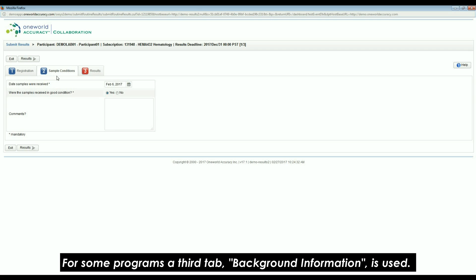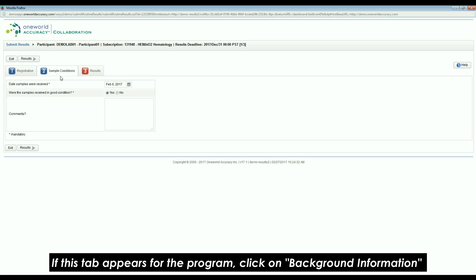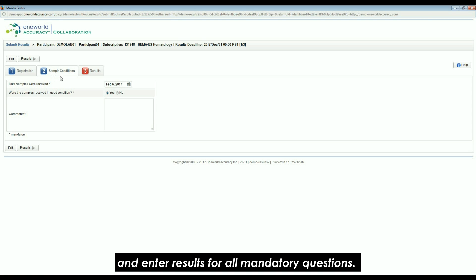For some programs, a third tab, Background Information, is used. If this tab appears for the program, click on Background Information and enter results for all mandatory questions.